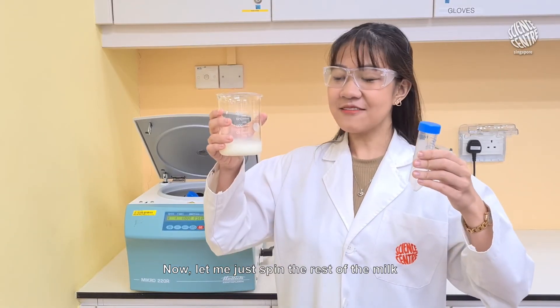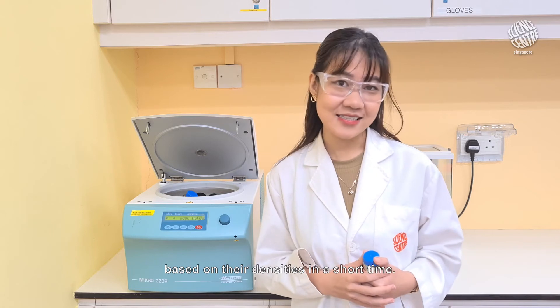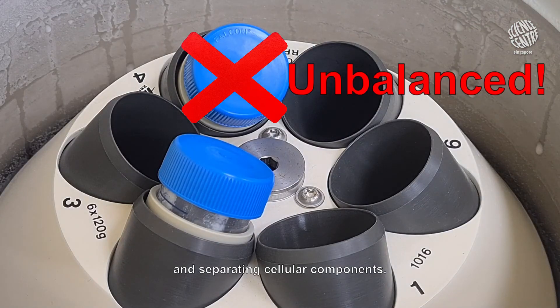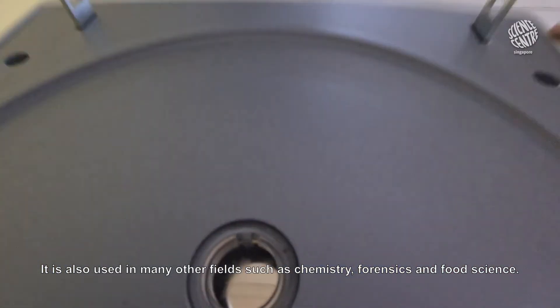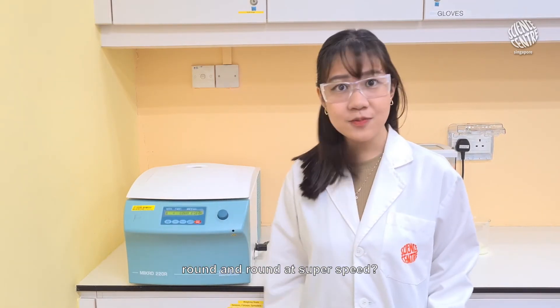Now let me just spin the rest of the milk and I'll have enough curds to make my powder. As you can see, centrifuges are great for separating mixtures based on their densities in a short time. In biology, this is useful for extracting DNA and proteins and separating cellular components. It is also used in many other fields such as chemistry, forensics, and food science. Isn't it amazing that we can do so much just by spinning something round and round at super speed?